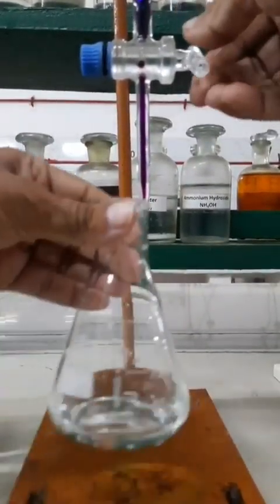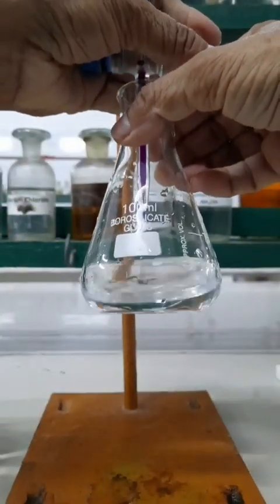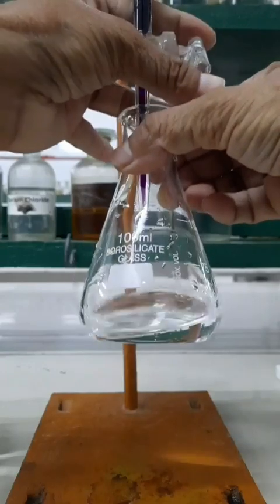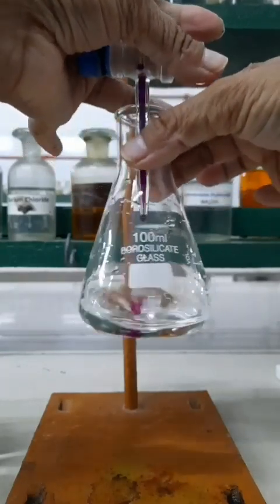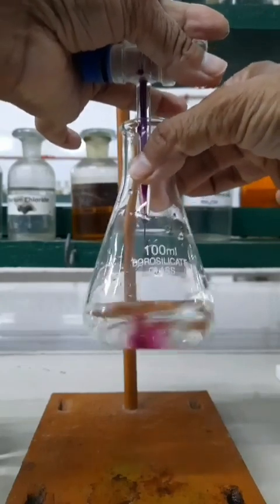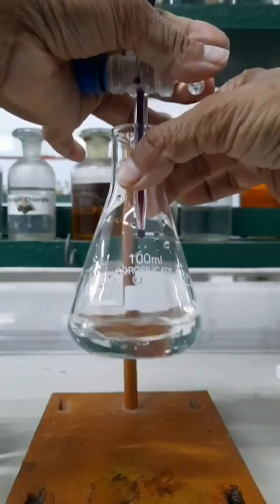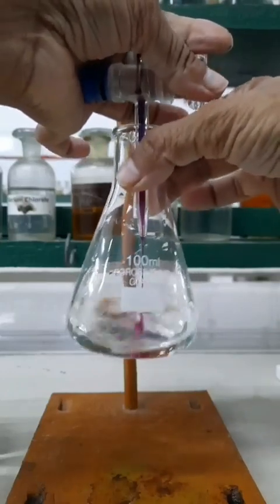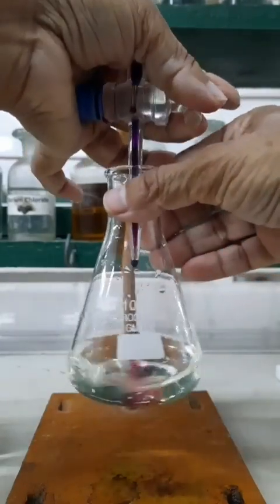Now while recording the second reading, first of all you add potassium permanganate solution slowly with continuous stirring, and when the reading approaches 9 ml, then you have to transfer it just drop by drop. Now here I am adding a small amount of potassium permanganate solution with constant stirring, and you can see that the pink color appears, and after continuous stirring it disappears.